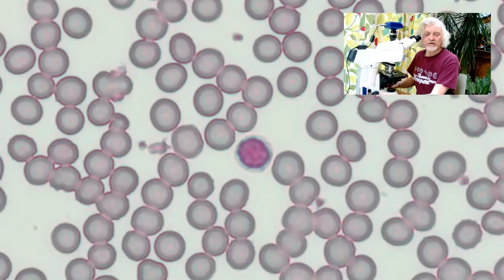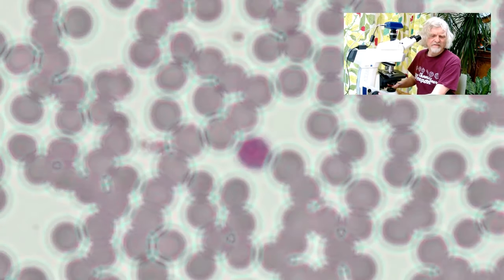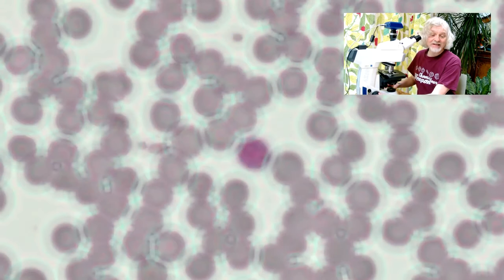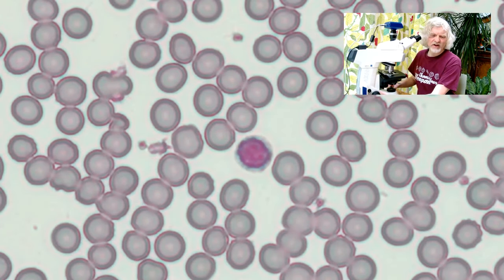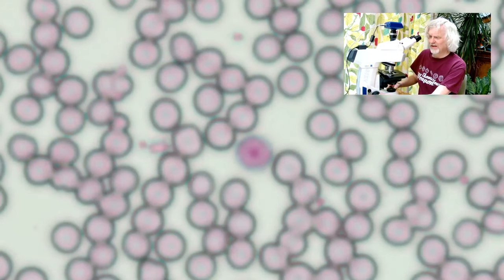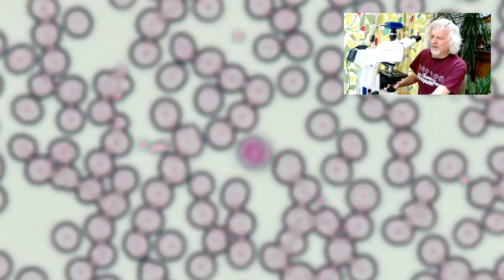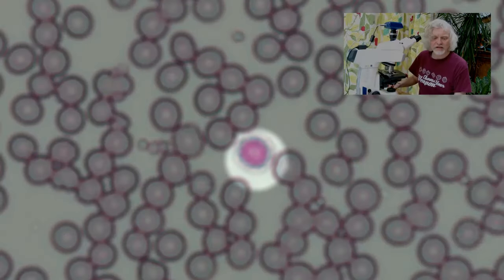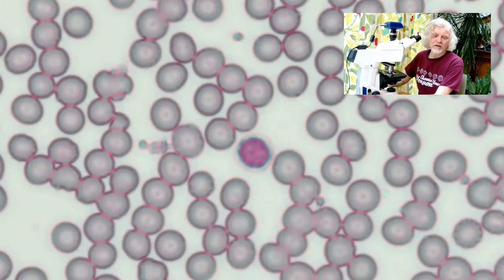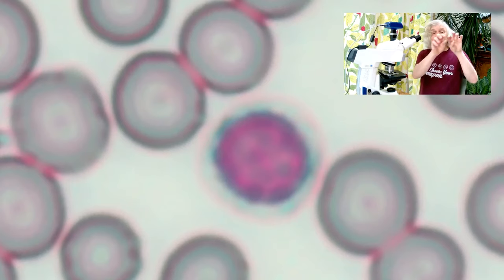If I focus on this cell very carefully, this cell is a white blood cell. White blood cells have cell nuclei, so that's what that big dark blue thing in the middle is. They've got a little bit of cytoplasm, but mostly it's cell nucleus. In fact, virtually the entire thing is cell nucleus. So here's a white blood cell in focus. If I zoom in on that a little bit, you can see a halo of the cytoplasm, but most of it's just one massive nucleus.